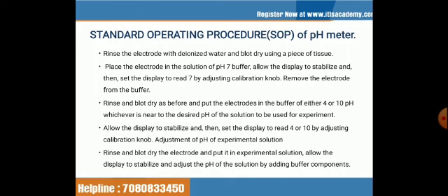For that I'll be discussing the calibration of the pH meter later in this lecture. These are the steps for a pH meter which is already set and gives accurate readings. But if somehow the knobs are disturbed or you don't get the accurate reading you need, then I'll tell you how to calibrate it later on.